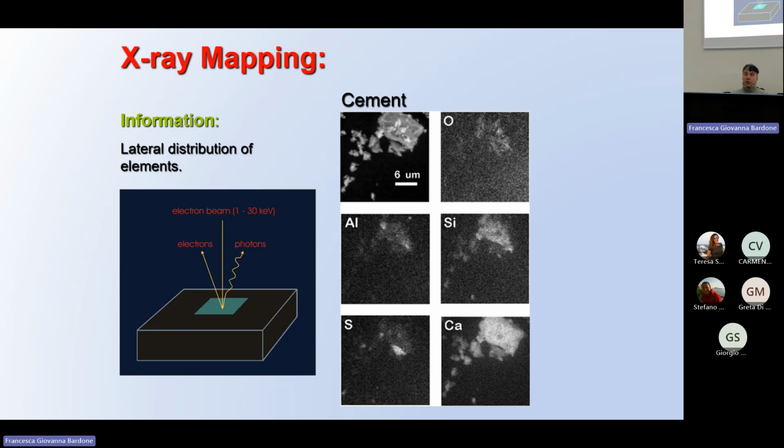And when we do quantitative analysis inside the scanning electron microscope, we calibrate the system with standards, and then we compare the experimental intensity to the standard acquired in the same condition. In this case, I can tell you the chemistry down to a fraction of a percent. So you need a standard for each of the elements that you are interested in.